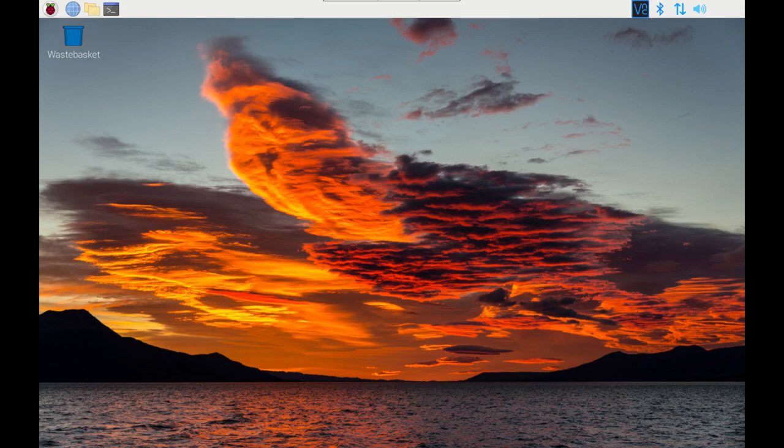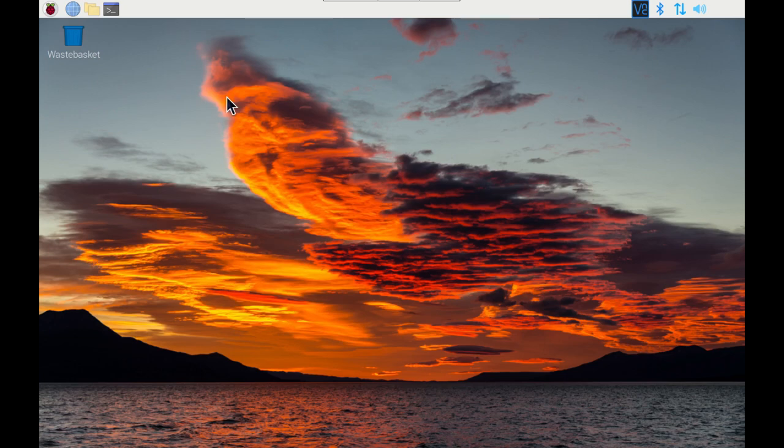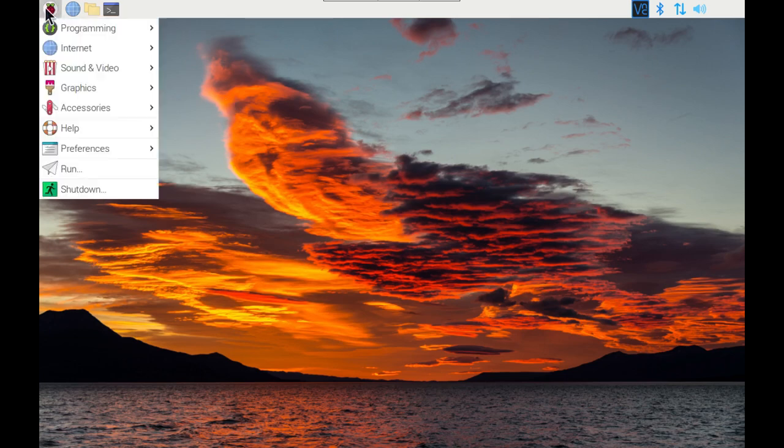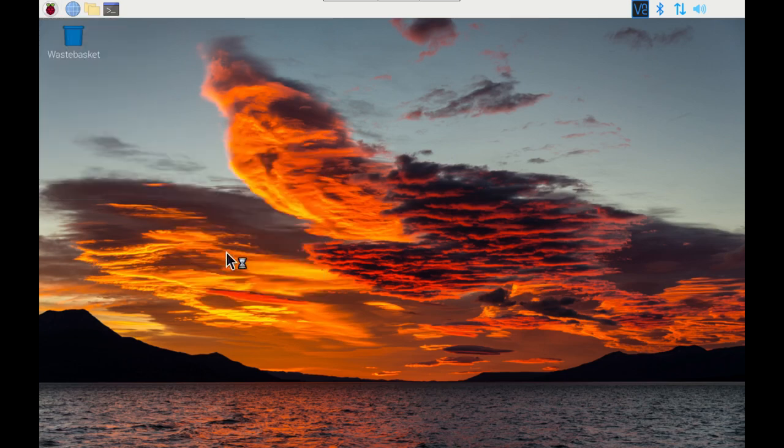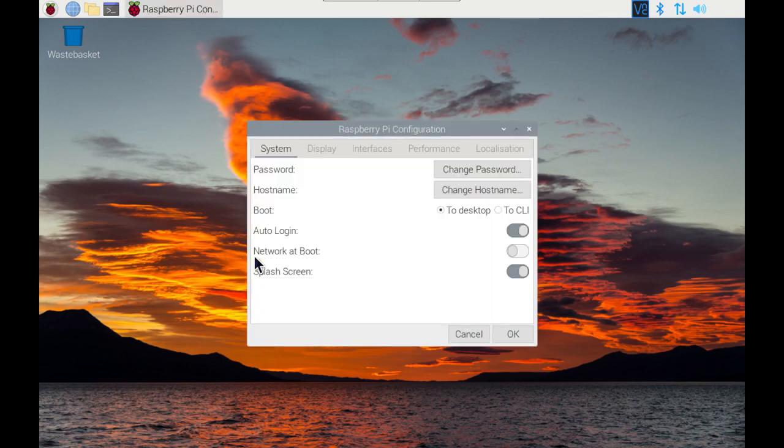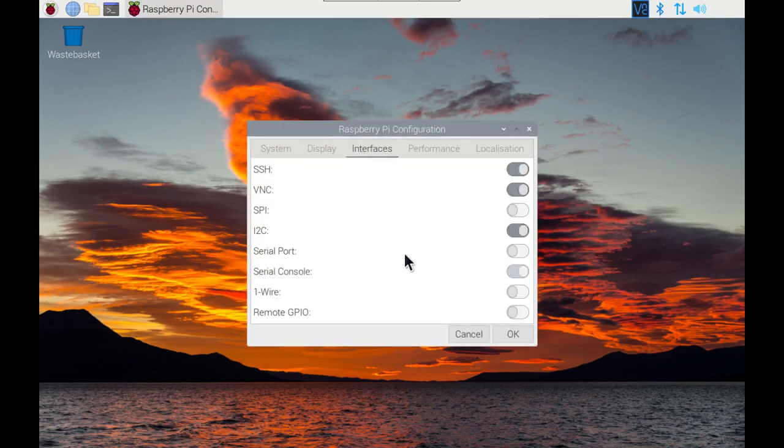Note that to use the Pi Camera 2, the legacy camera mode should be disabled. You do need I2C enabled. You can see that through the Raspberry Pi configuration under interfaces. Just make sure that that's turned on.